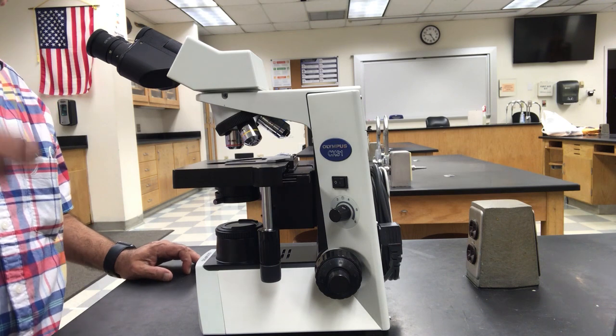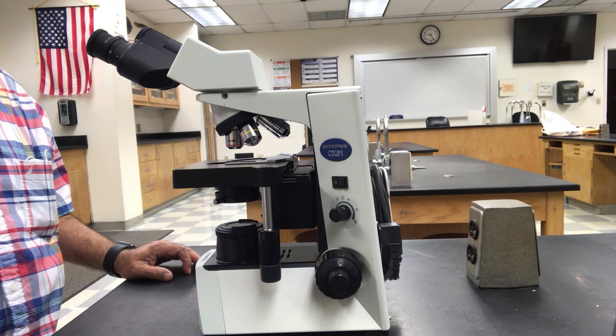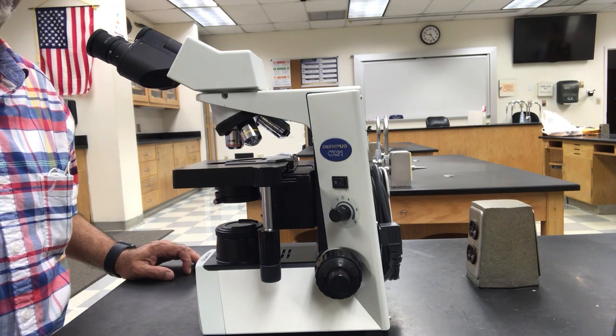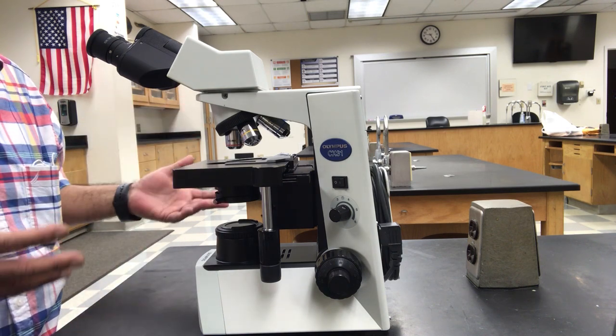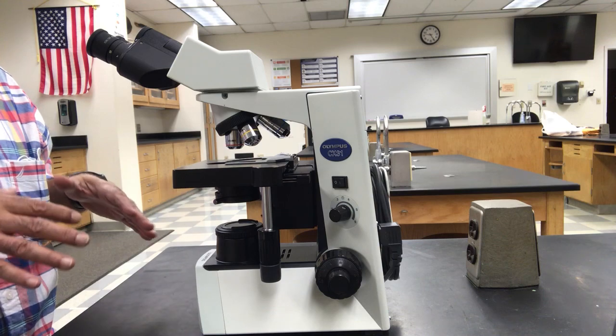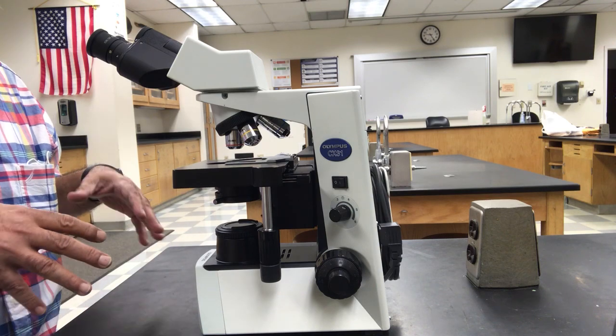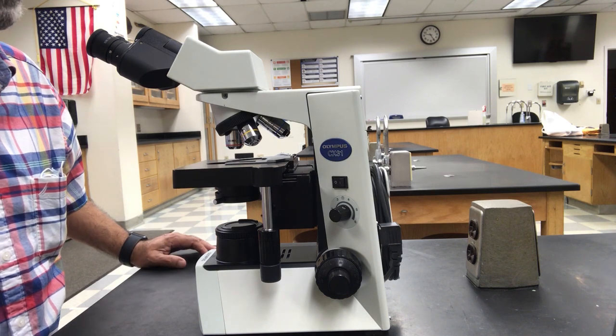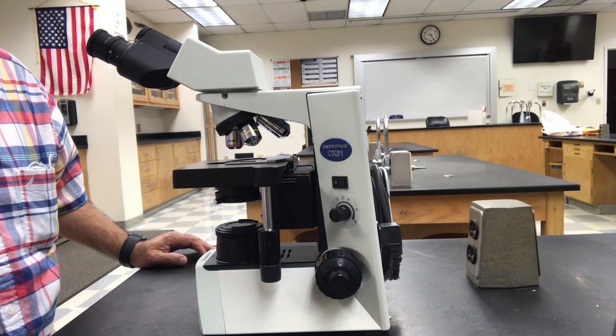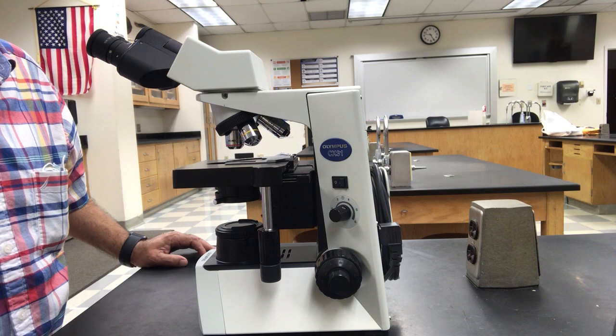Imagine the cell, it has even a smaller structure called nucleus inside. When you enlarge, it could easily make it blurry, but the microscope has the ability to avoid blurriness, so you'll see clearly much bigger cell, nucleus, etc. The microscope can be simple or compound.